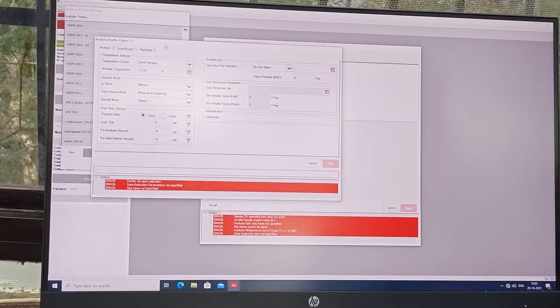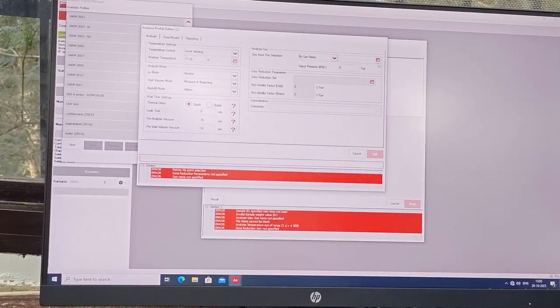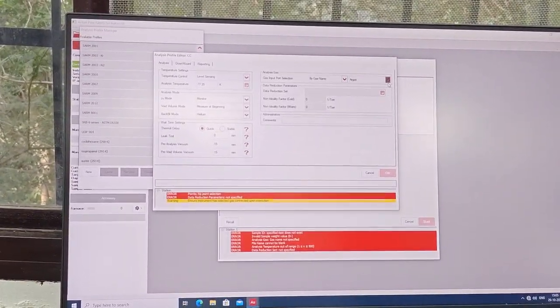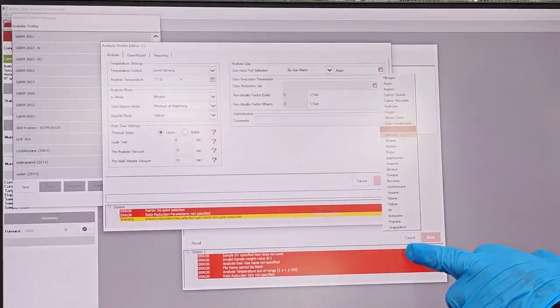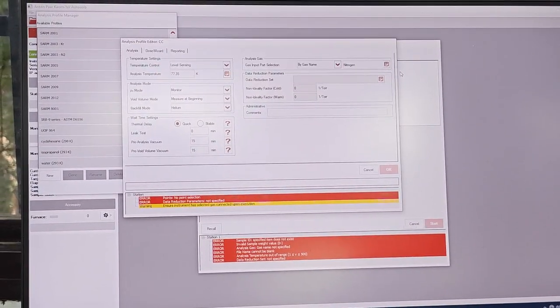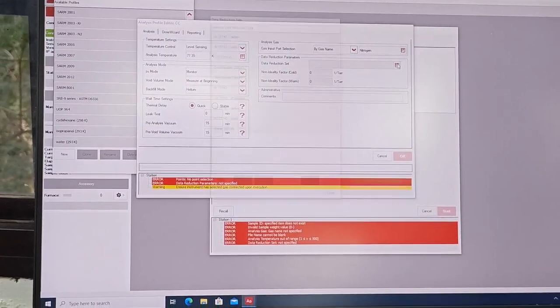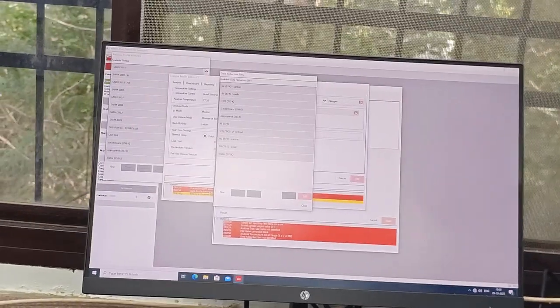On that carbon, whatever the material, which is called the adsorbent, here we are choosing nitrogen. There are so many gases: carbon dioxide, argon, krypton. But nitrogen is best. Where is the nitrogen cylinder? It is outside, there is a cylinder chassis. Yes.